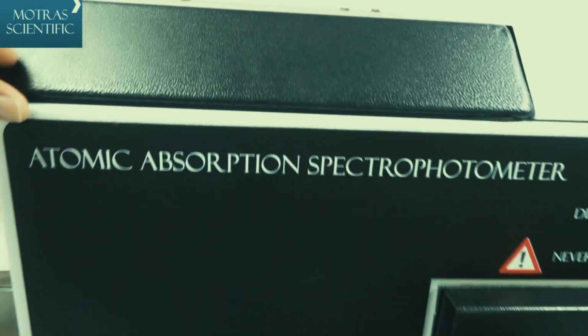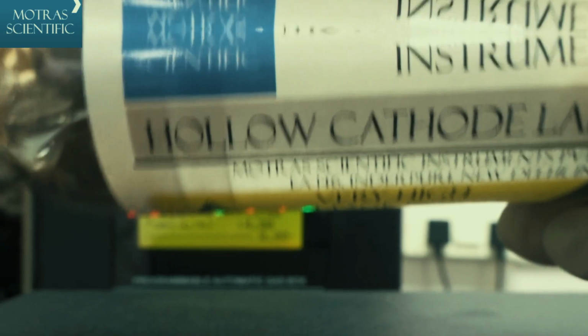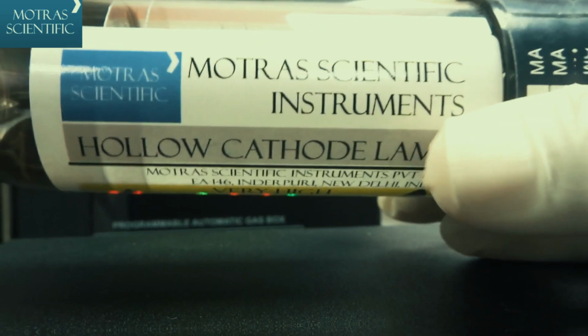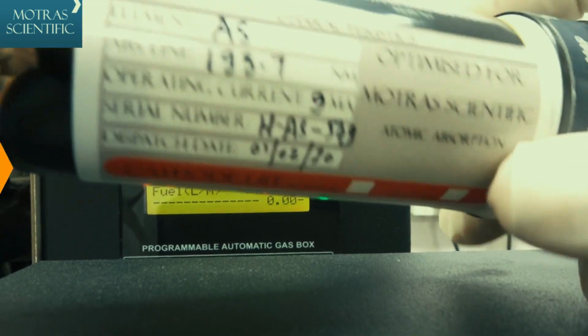We will now see the lamp installation. We will be using our arsenic lamp for this demonstration. The lamp parameters are listed on the lamp itself for quick configuration.